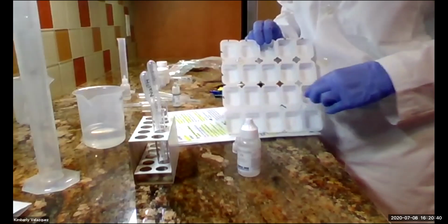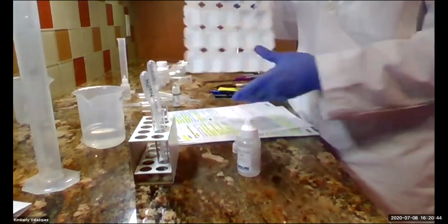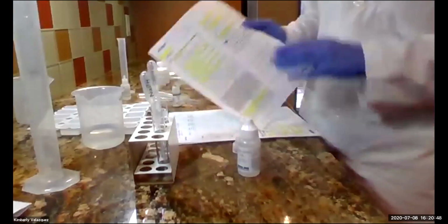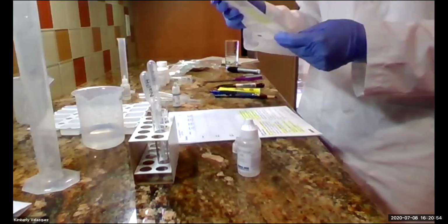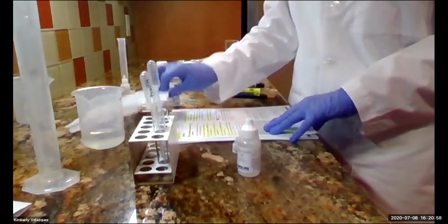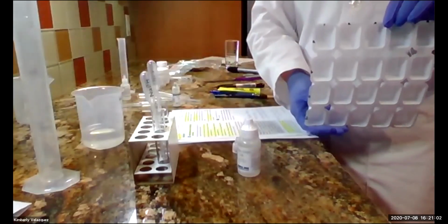Row C is going to have your pH 6 buffer all the way across. And row D is going to have your pH 8 buffer all the way across. I'm not going to walk you through every single step of this, but I do encourage you to highlight and write notes so you understand what you're doing. Remember, at the end, you're going to take a picture to document your results. You're then going to rinse this out because this same thing gets used for part 2.